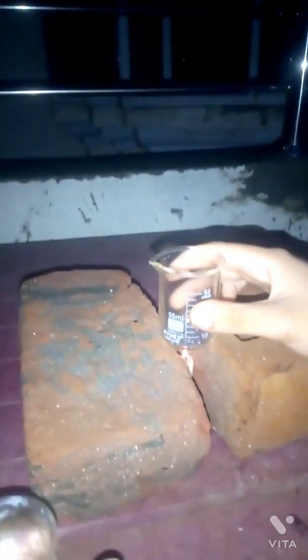So the iodine goes inside, a little bit more. I think it is enough iodine for the beaker. Turn on the candle, and now place a beaker on the top.